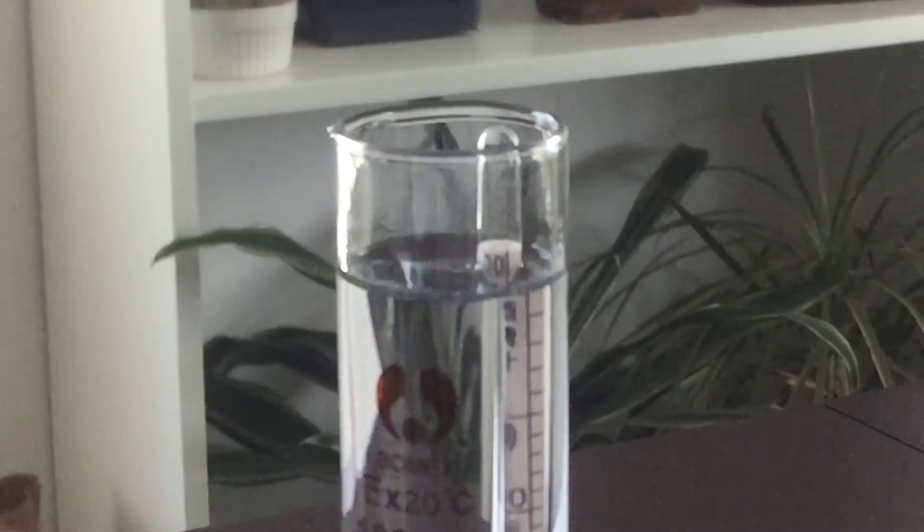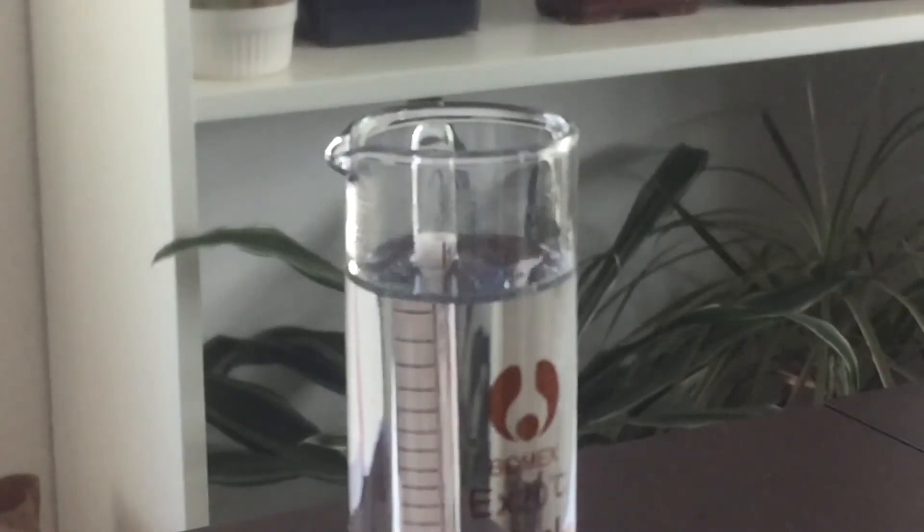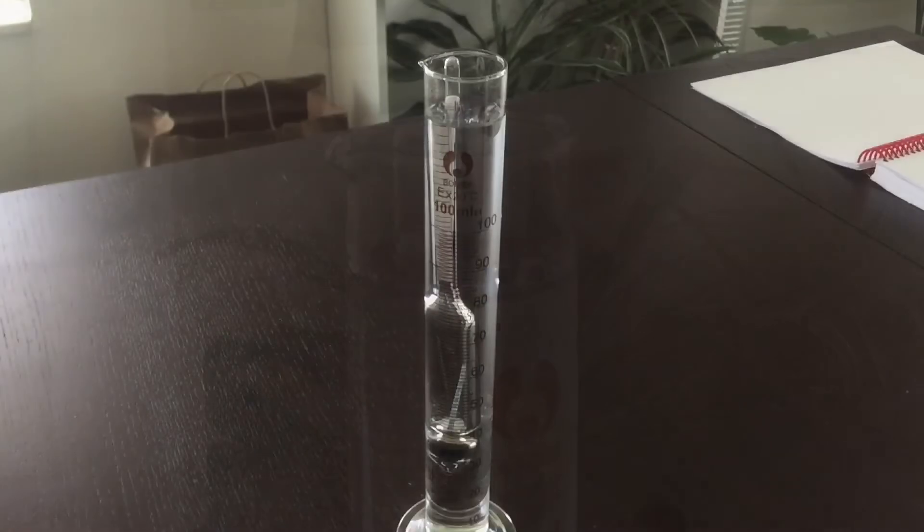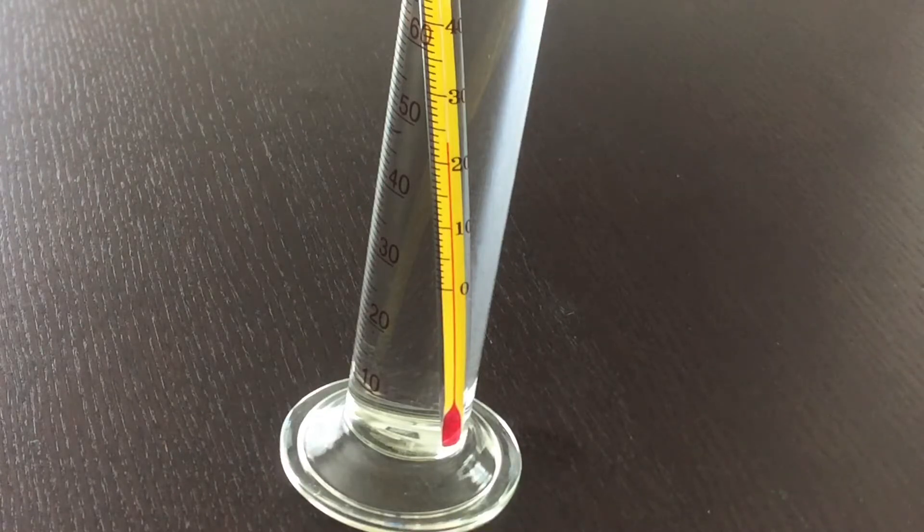There is a slight discrepancy with the temperature because these are rated for 20 degrees Celsius. And as you can see here I put the thermometer in afterwards just to test it. And the temperature is slightly above 20 degrees C.